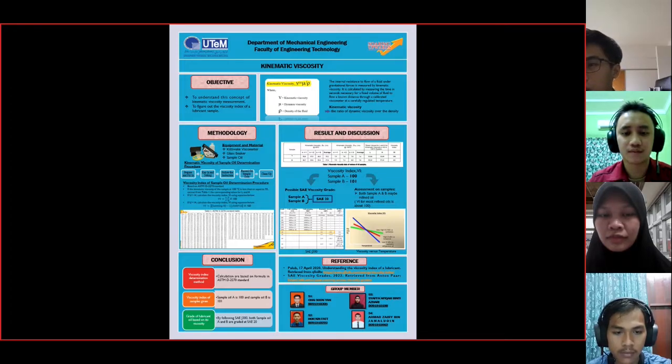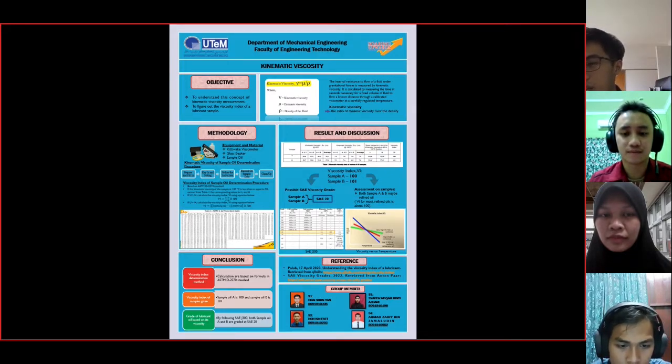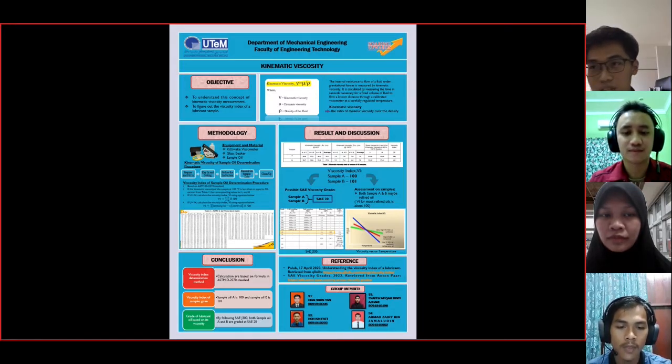After we get L and H, we substitute back into the equation for calculating viscosity index.